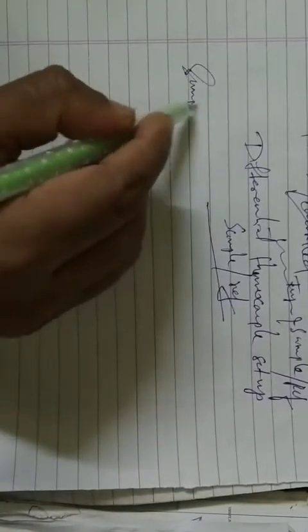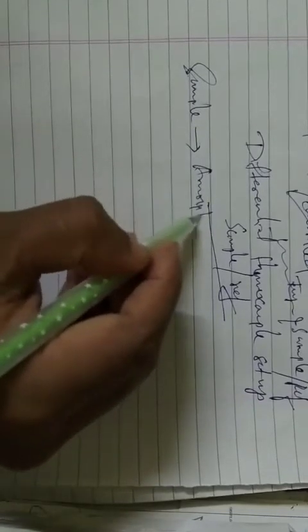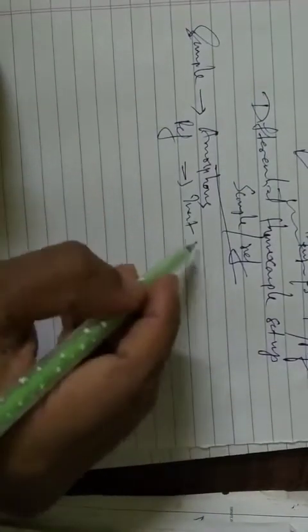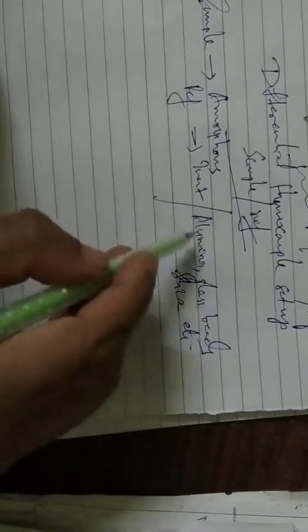Now the sample we are taking is amorphous in nature. Amorphous means powder, so we have to take it in powdered form. The reference we are using is an inert material, made up of alumina, sometimes glass beads, silica, etc. So this is how the reference material, which is inert in nature, is composed. This is how the working starts.